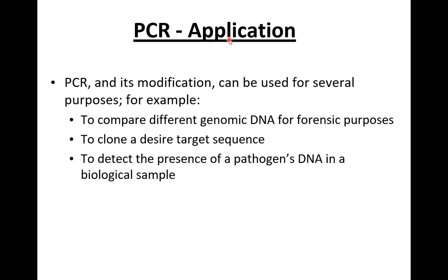You can actually clone that promoter by doing a PCR that goes through the promoter. So if you design a primer before and one after the promoter, then you can make millions of copies of that. Then you can include that into a plasmid, and then you can do different studies with that. You can do that with a gene as well, the coding sequence as well.